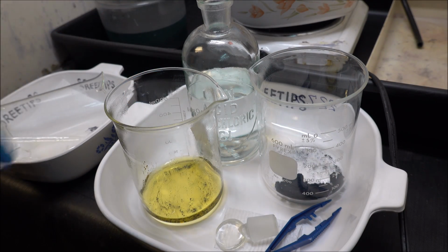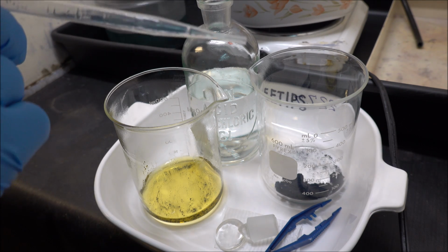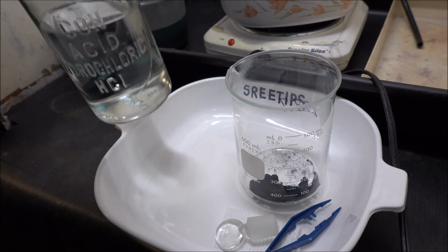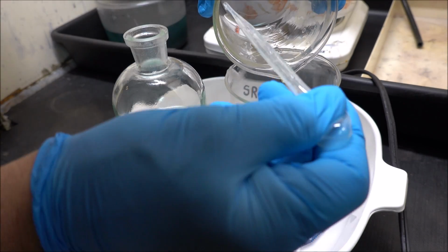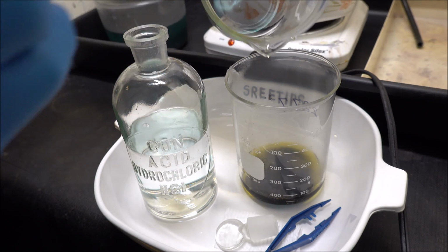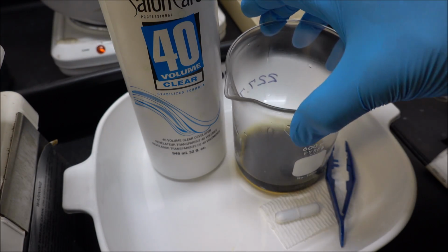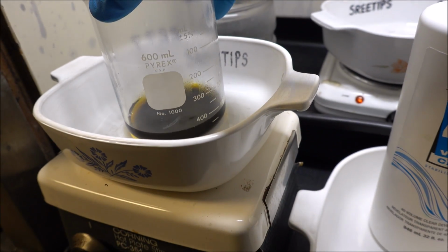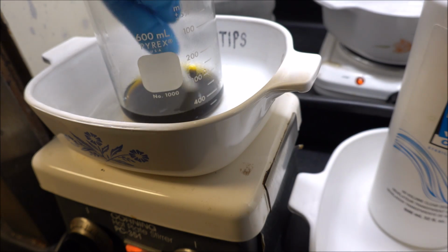I'm going to transfer this solution into this beaker, so we got it all in one beaker, and then we'll start the process of dissolving it. Got the material down here in the bottom of this beaker now. What I'm going to do is put it up over here onto the stir plate. I'm going to start stirring. Got a stir bar here, put that in.